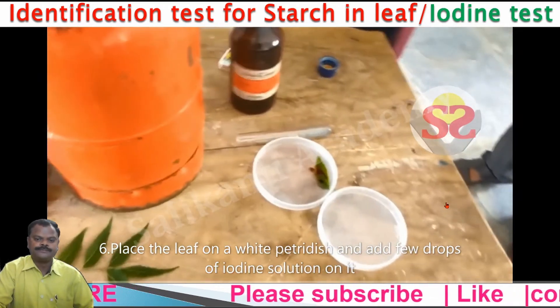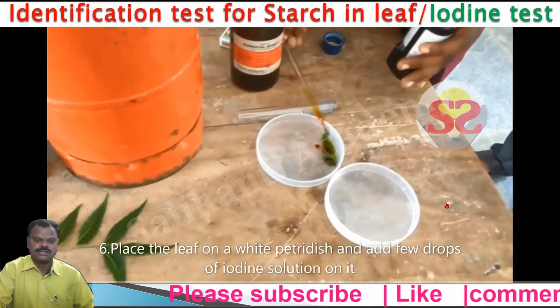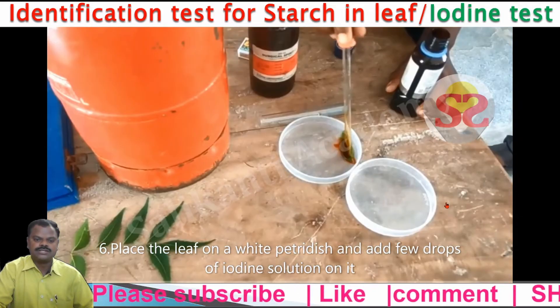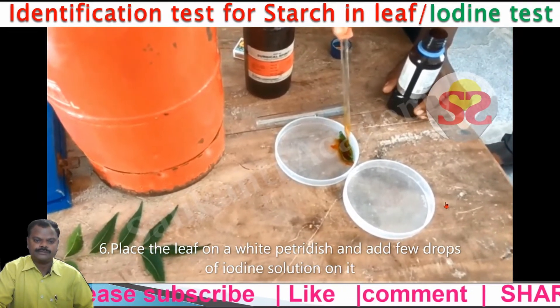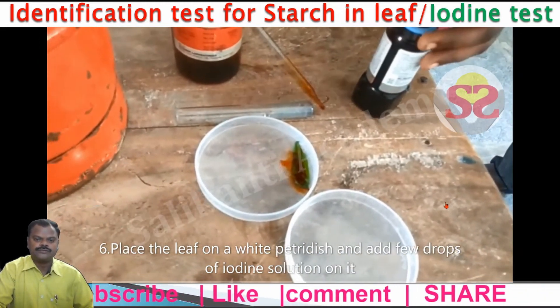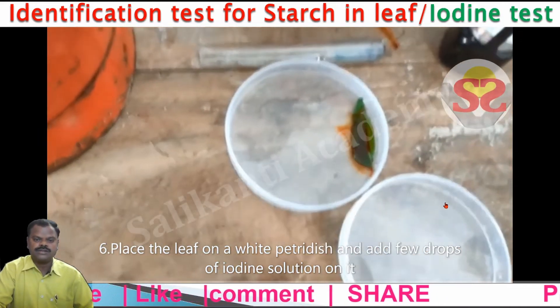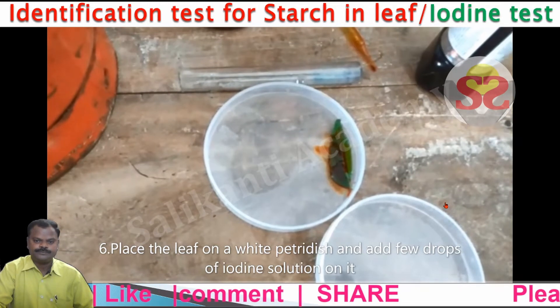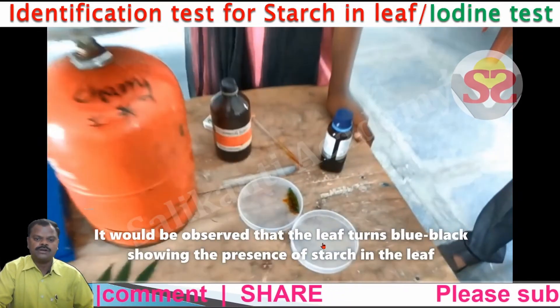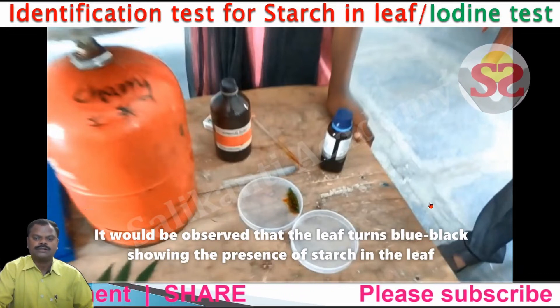We also learn this starch test in 7th class. Iodine solution changes the starch into blue-black color. By doing this test, we confirm the leaf produces starch. In the photosynthesis process, the leaf produces starch. It would be observed that the leaf turns blue-black color, showing the presence of starch in the leaf.